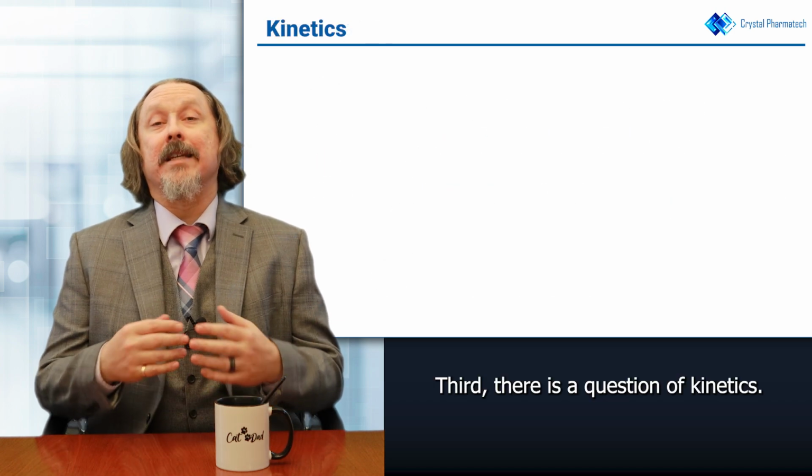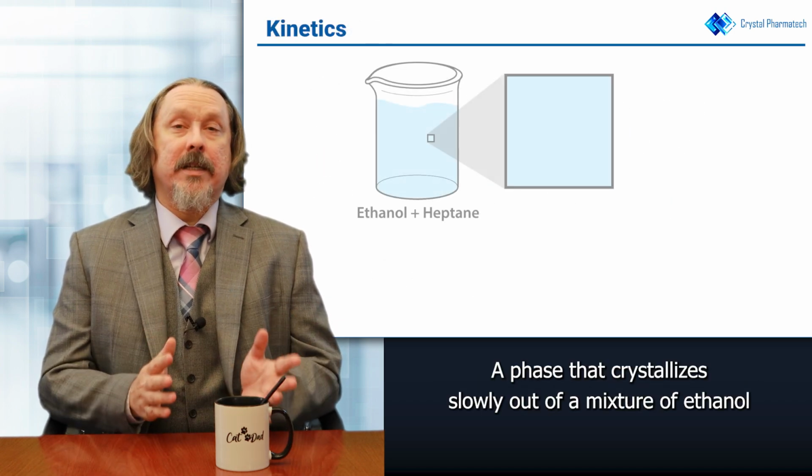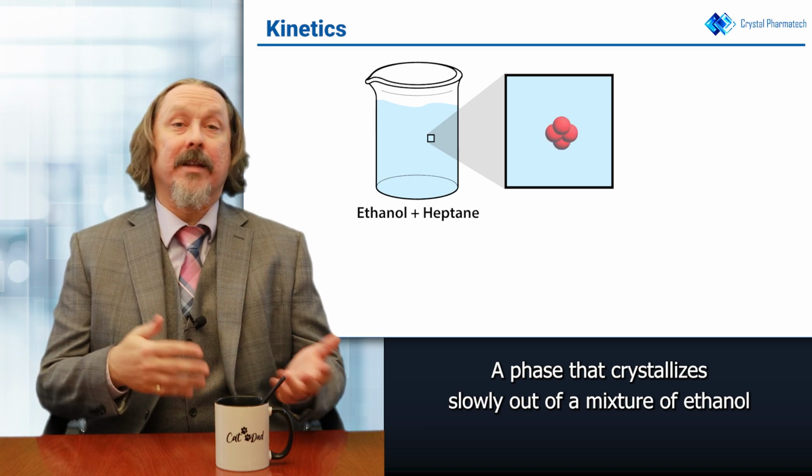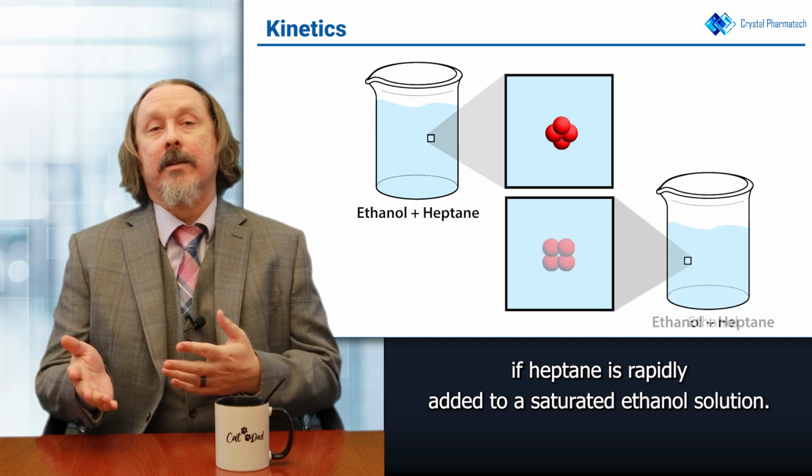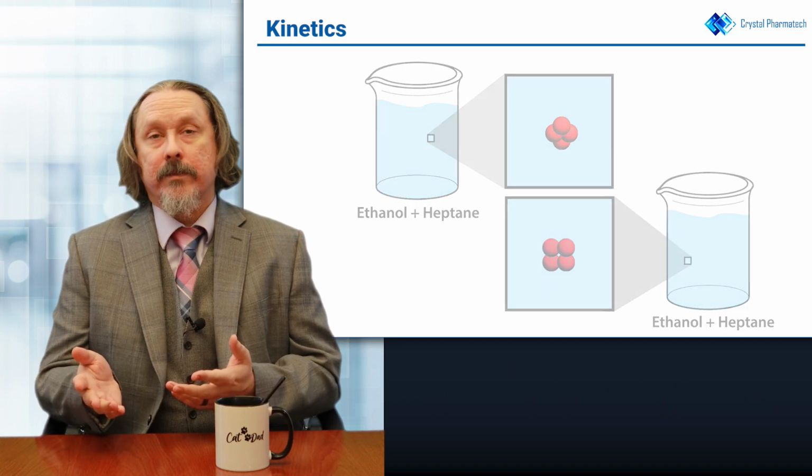Third, there's a question of kinetics. A phase that crystallizes slowly out of a mixture of ethanol and heptane might not be the one that forms if heptane is rapidly added to a saturated ethanol solution.